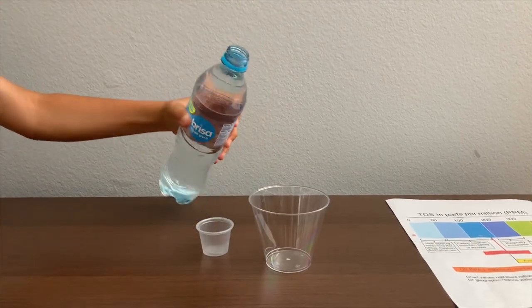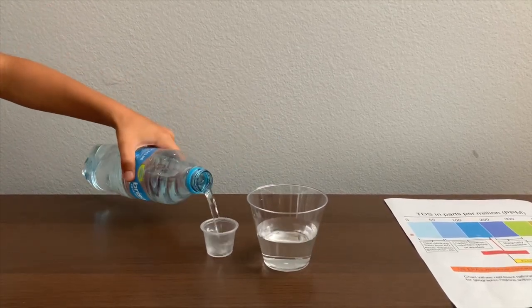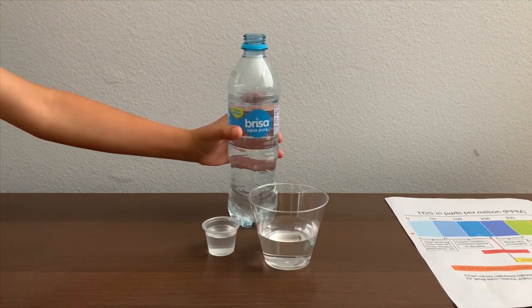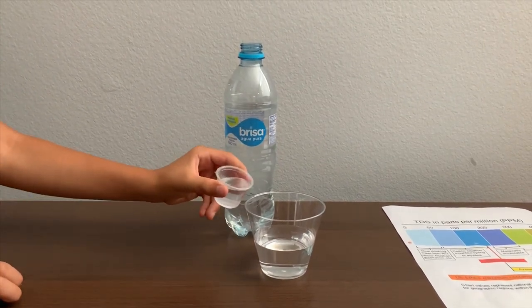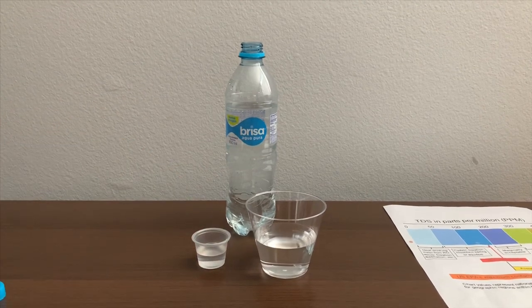Let's pour some water in. This is a little too much for the pH cup — let's pour some back in the TDS cup. First, let's test the TDS level.